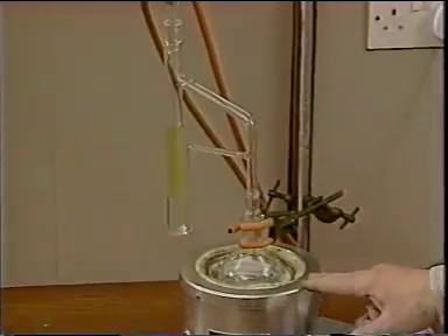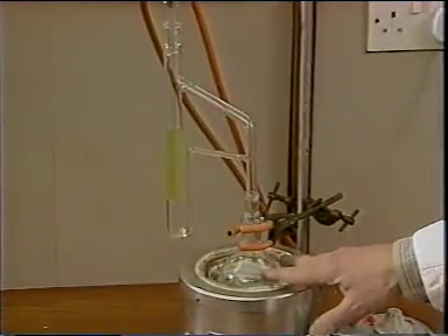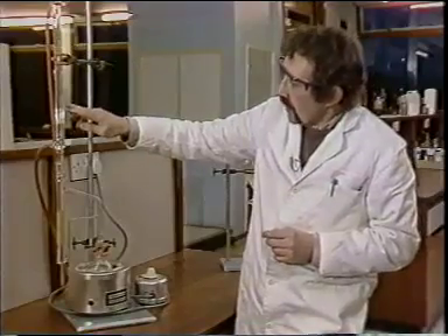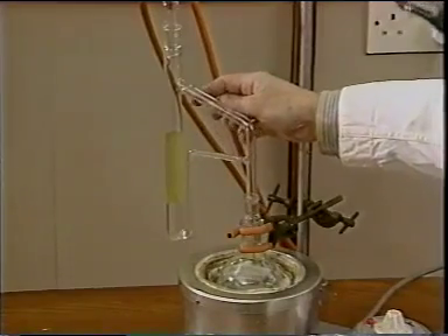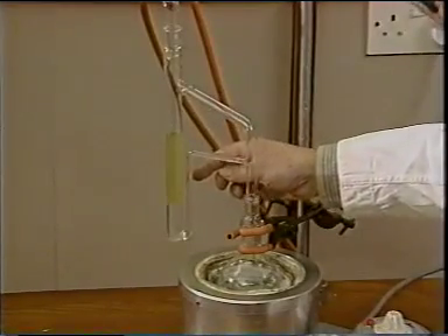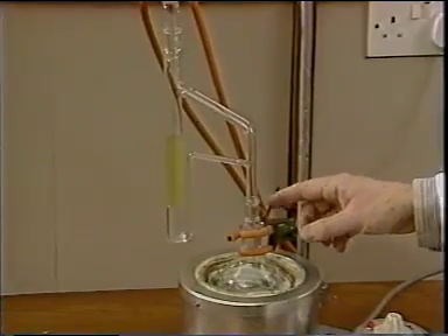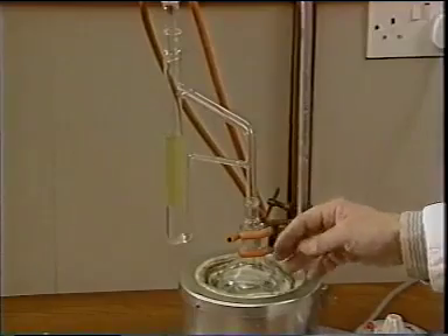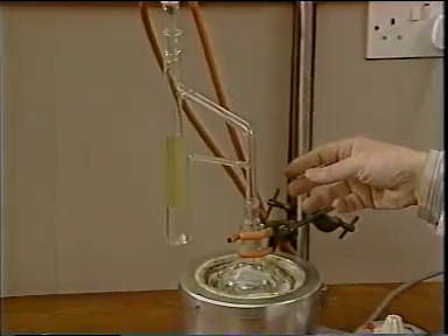Let's look at the features. In the flask here, we have refluxing solvent, and the vapour ascends into the condenser and drips back through the aqueous solution, extracting our compound as it goes. The organic solution is then returned from the base of the tube back to the flask.